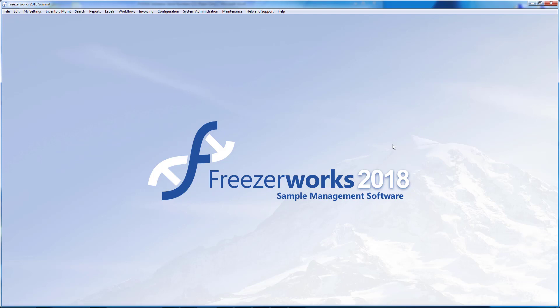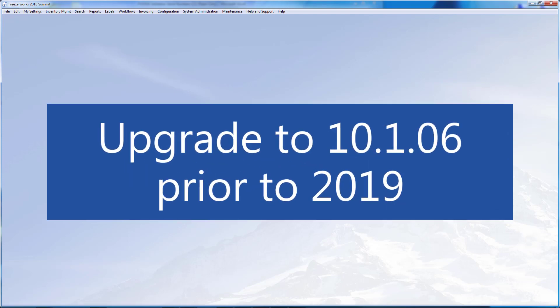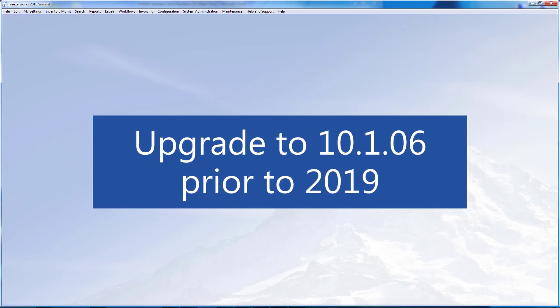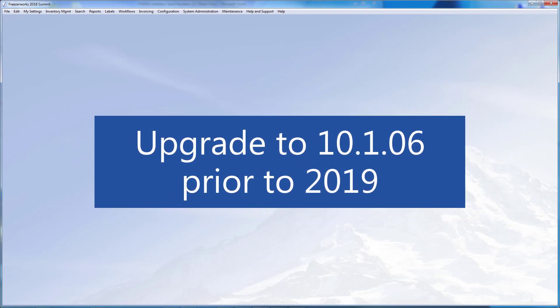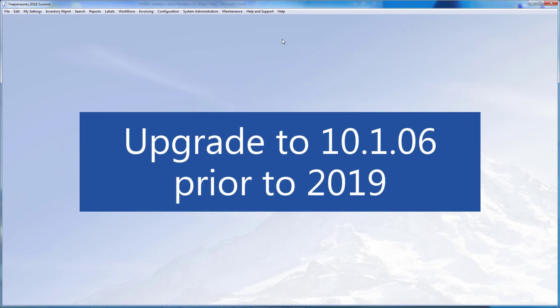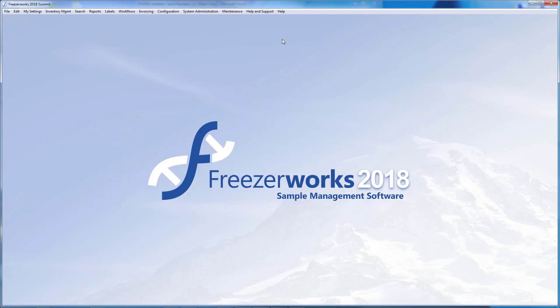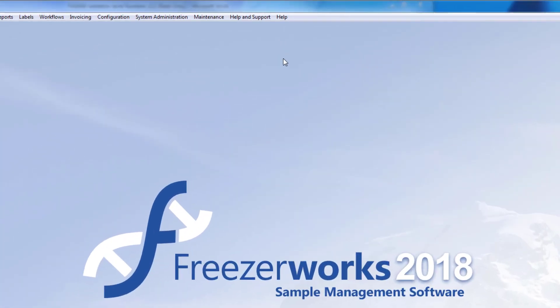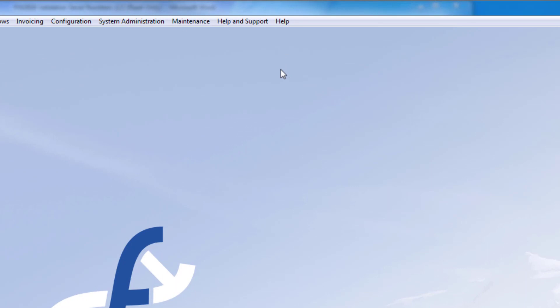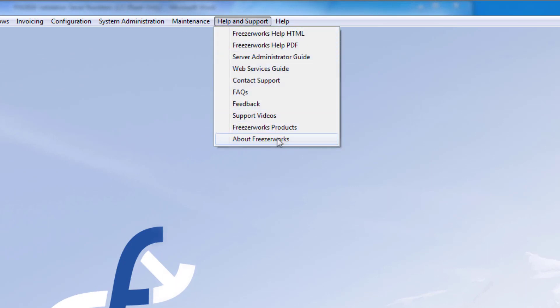Before we get started, first ensure that you are in the latest version of FreezaWorks 2018, 10.1.06. The nature of the 2019 upgrade means you may have to run it multiple times, and upgrades prior to 10.1.06 were very data intensive. Save yourself some time and use the About FreezaWorks option in the Help and Support menu to ensure you are in the latest version.